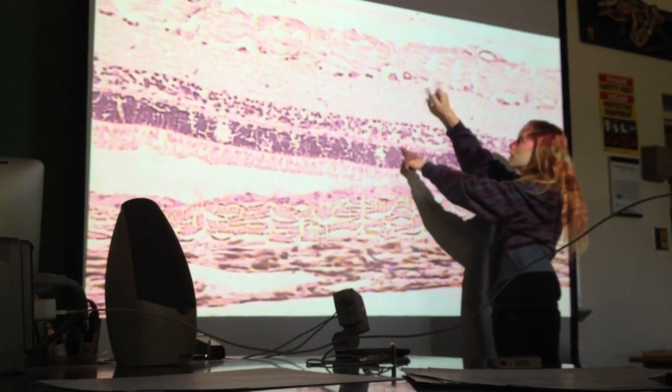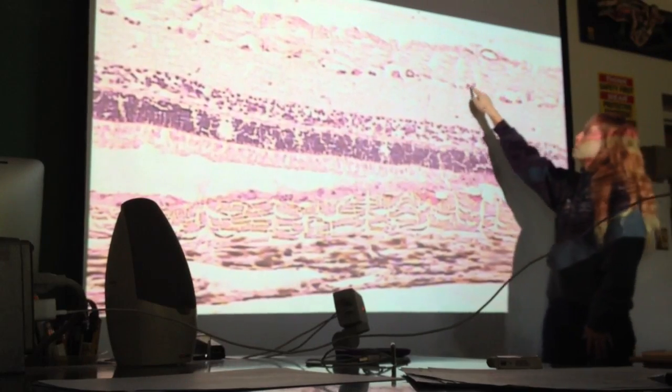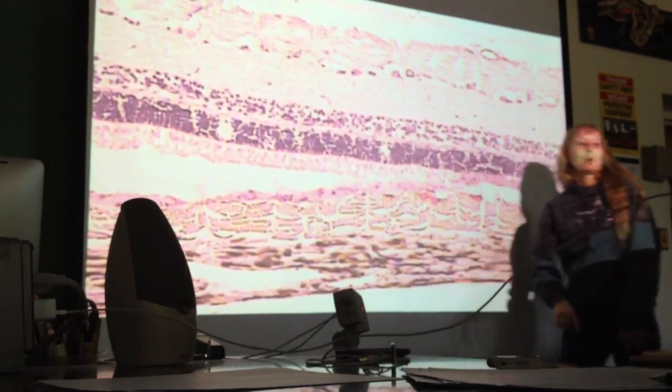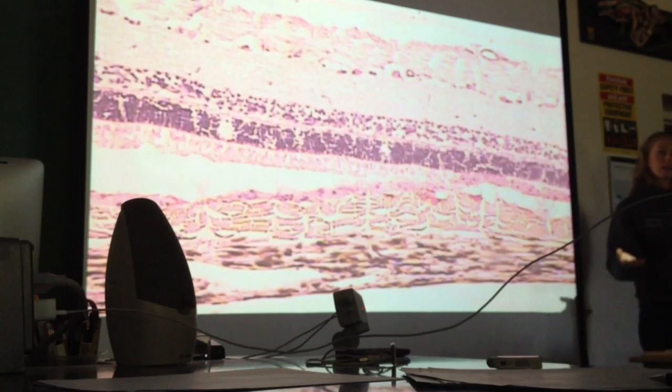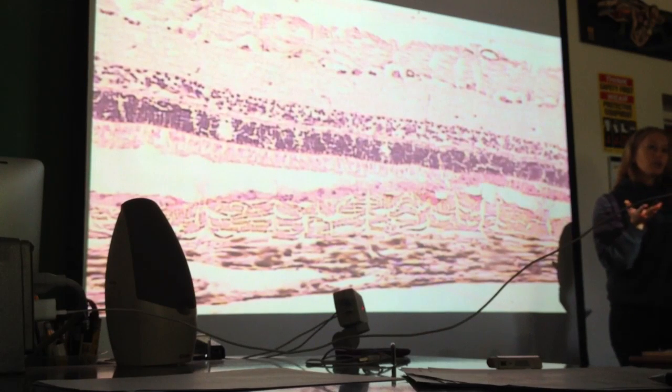Okay. Now I know that this is the ending point because we have these dispersed purple nuclei, all right? Remember back from before break, last Wednesday, we were looking at the cerebellum, and we had Purkinje cells, and they were part of the layer of the gray matter. I explained that they kind of are a breadcrumb trail, right?